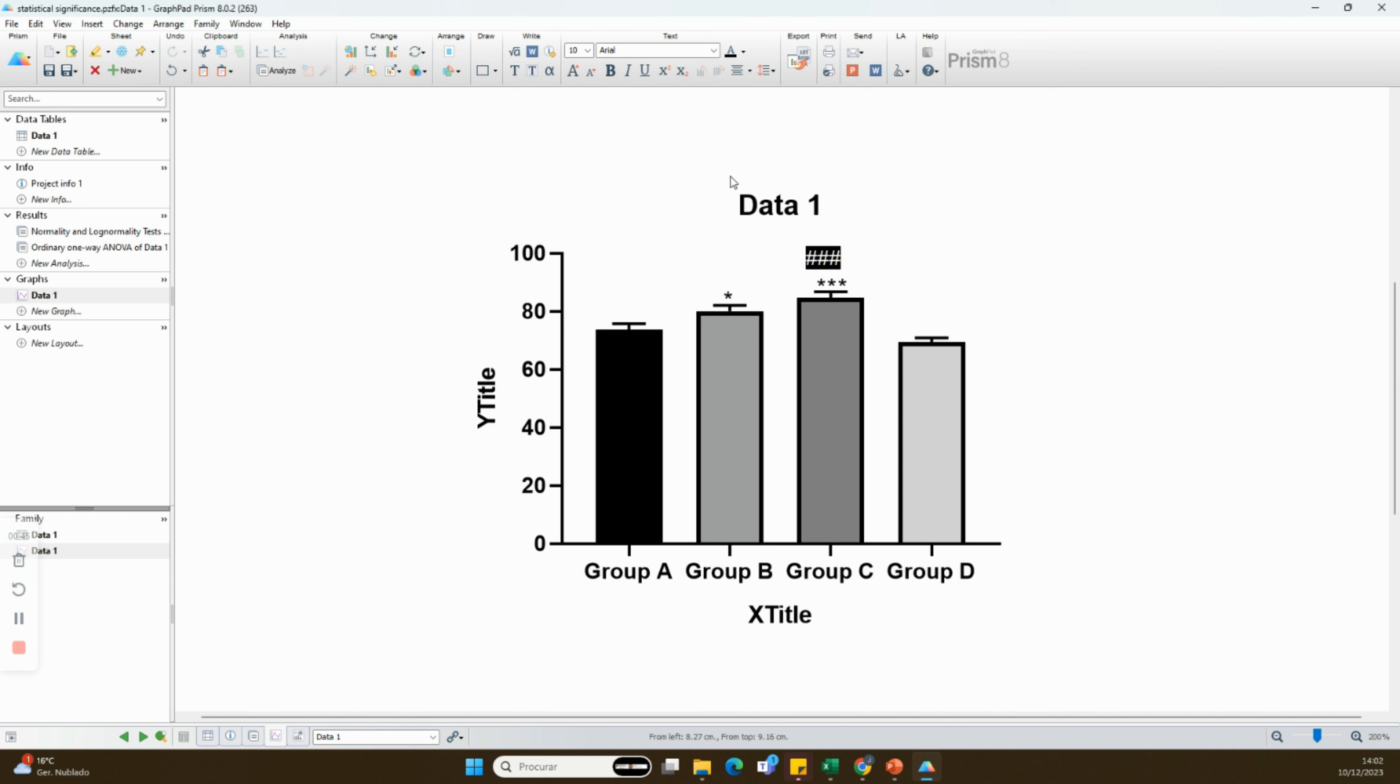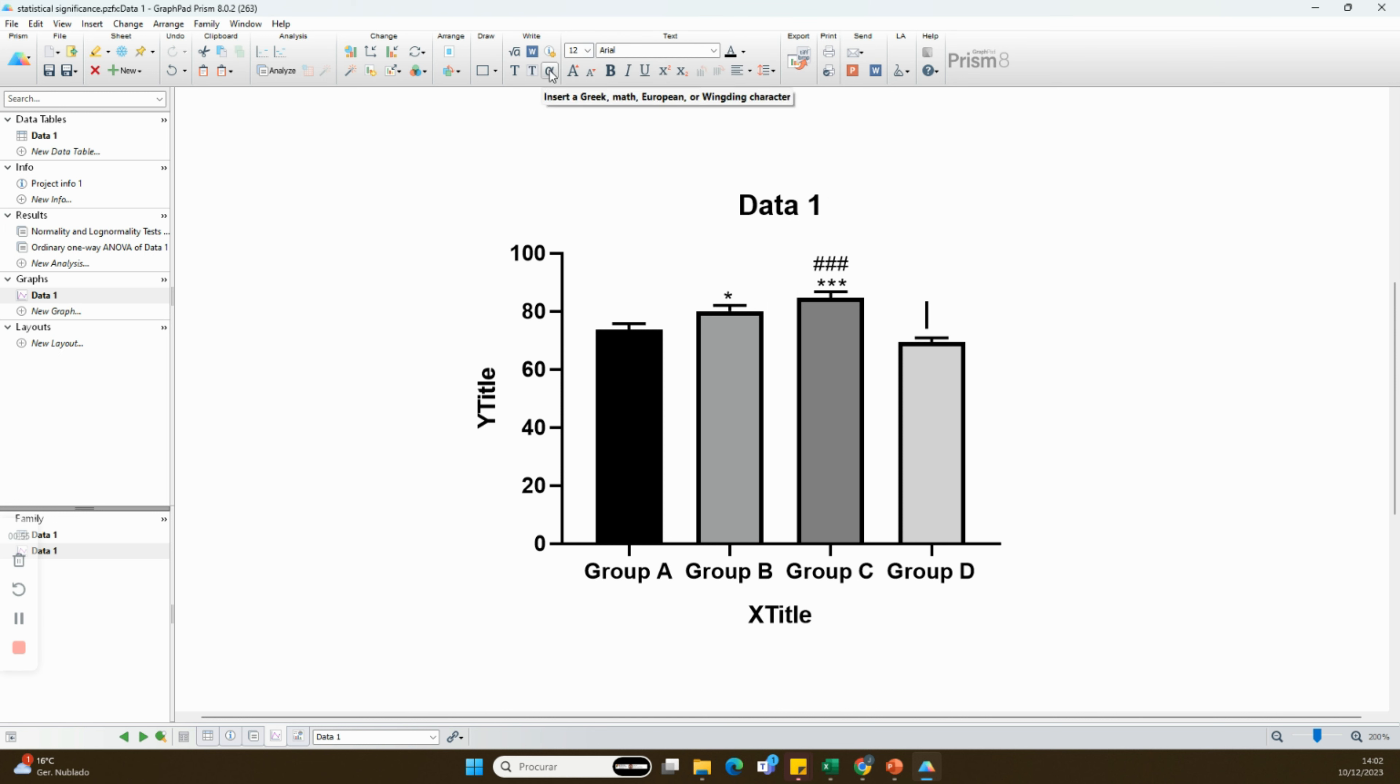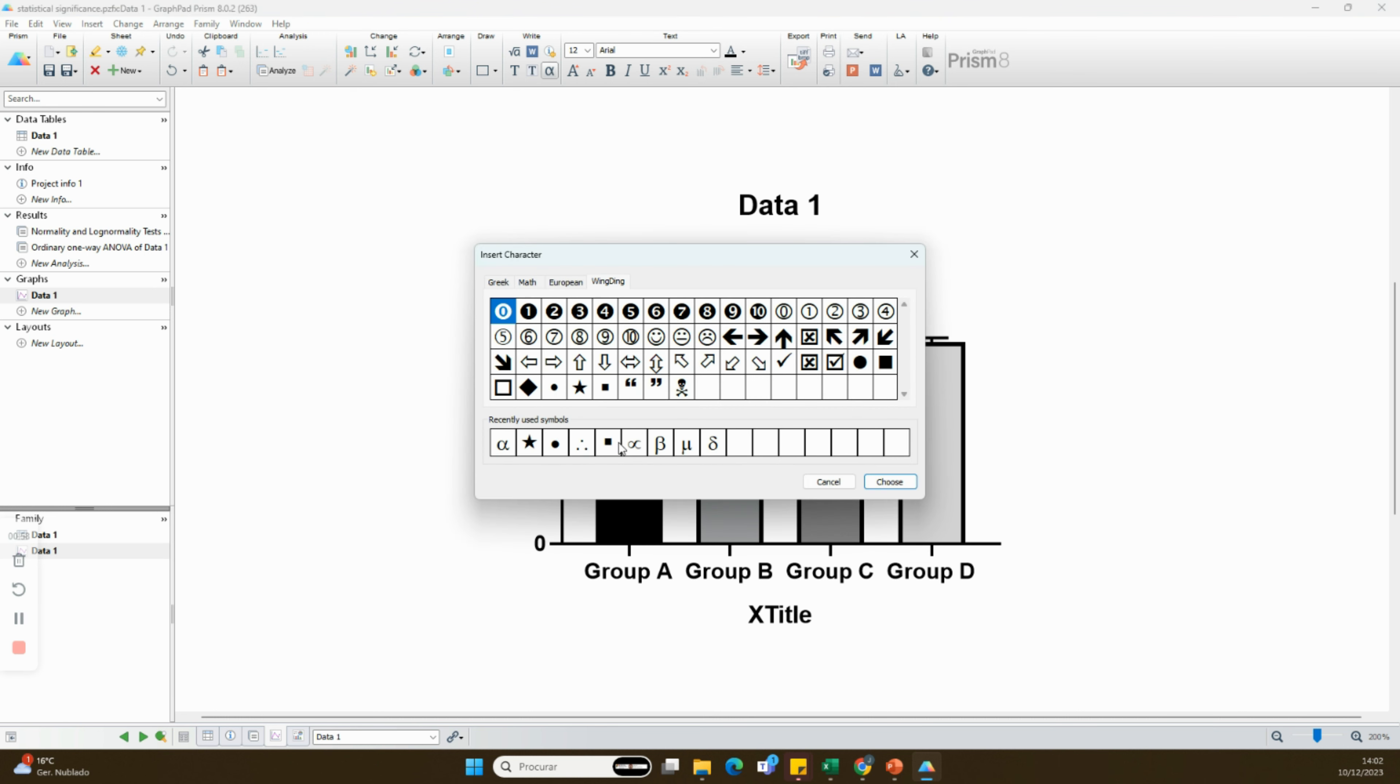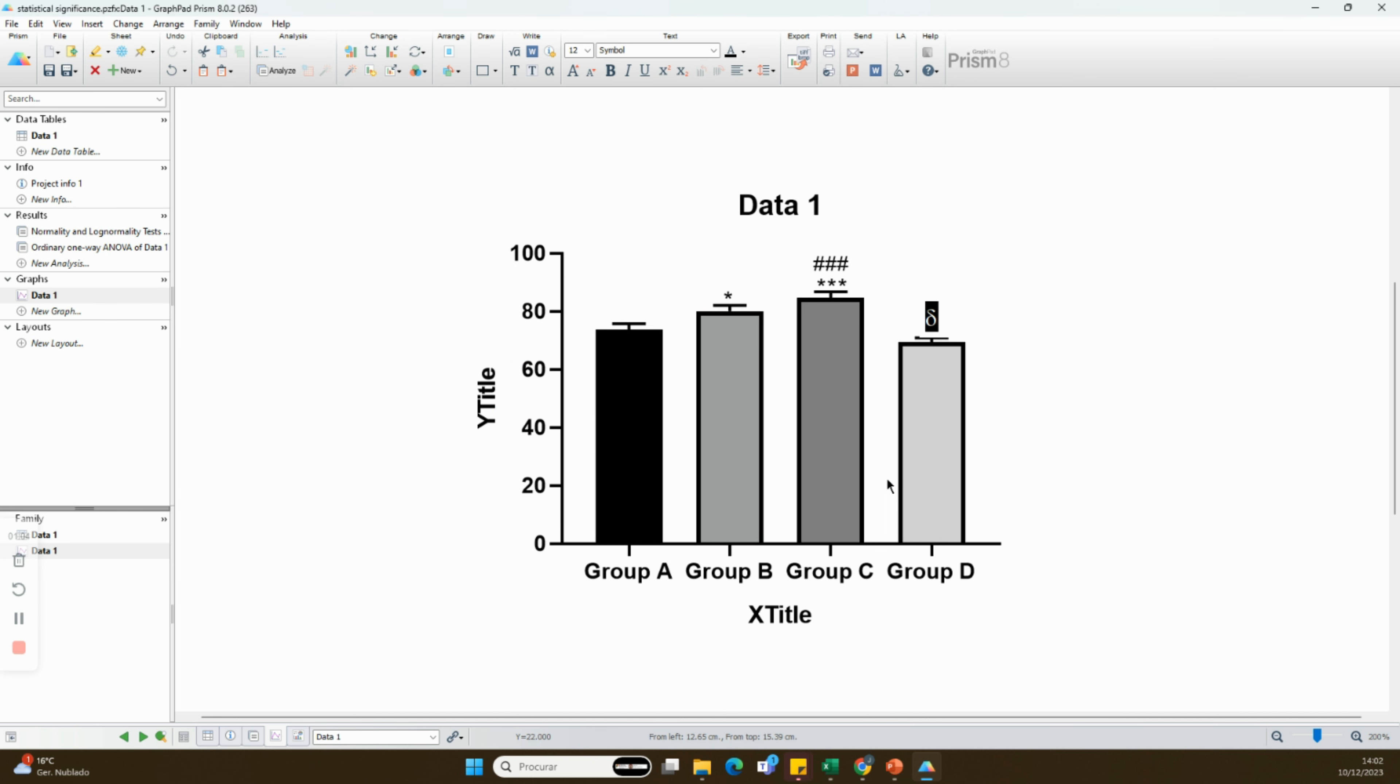In this example, the differences between group A and the other ones are denoted by asterisk, the ones between groups B by a cardinal, and the ones between group C by the Greek letter delta.